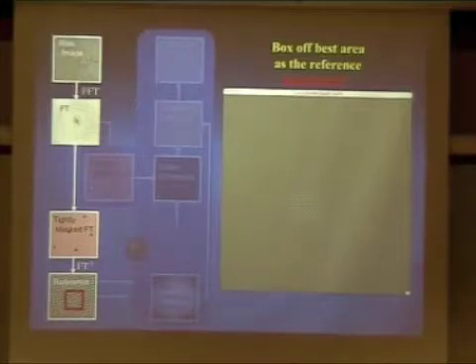A question was asked, how big is the area that you mask? Off the top of my head I said between 10 and 20, and when I looked back, it turns out that it's about 10 to 20% of the image that I normally use. Because of the way we normally scan, that comes out to be about 5 to 10 unit cells.